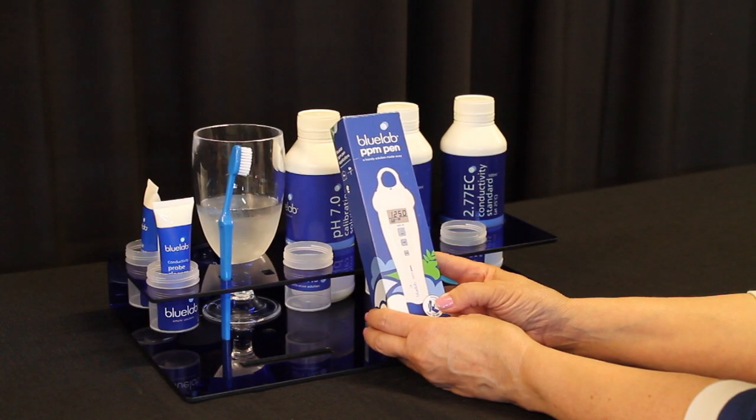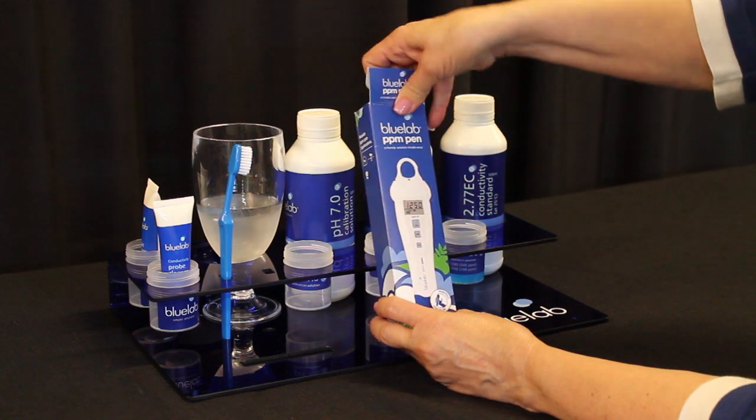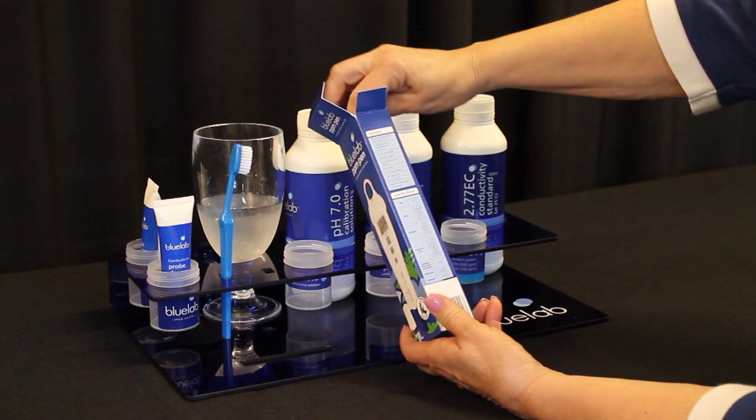Welcome to Bluelab's video on how to calibrate and clean the Bluelab PPM pen. Remove the PPM pen from the package.